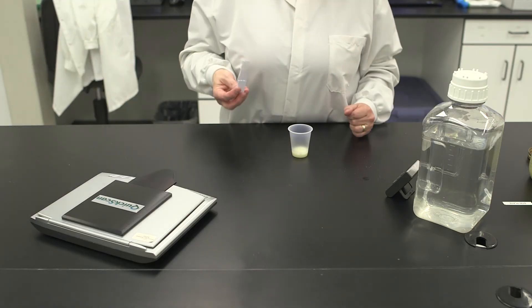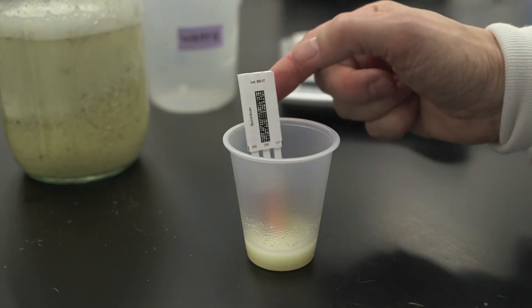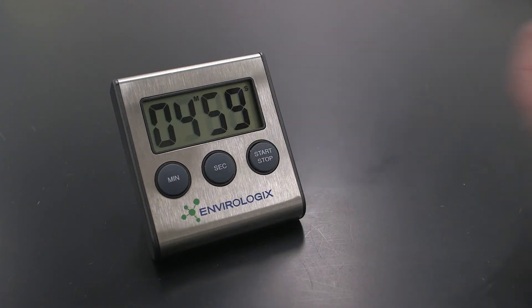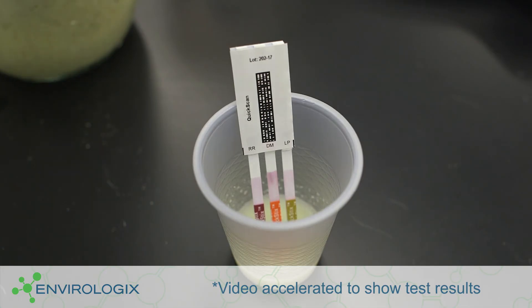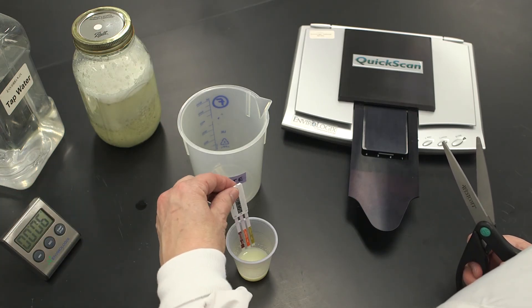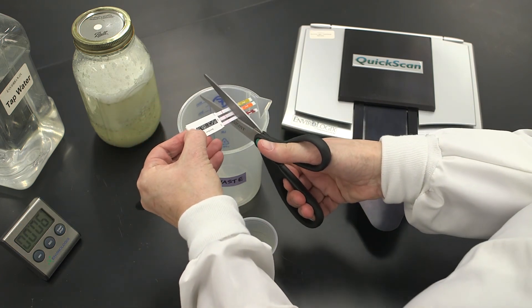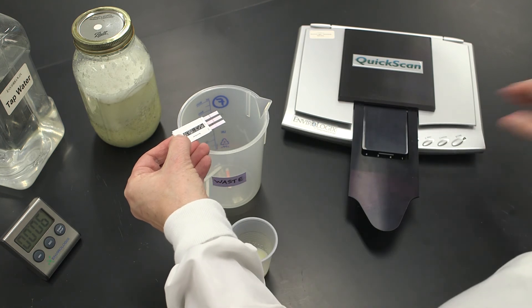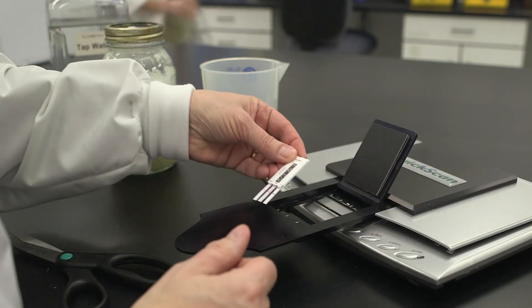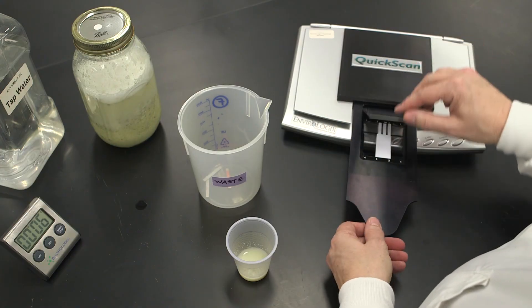Insert the quick comb into the cup with the arrows pointing down. Allow five minutes for the reaction to occur. At exactly five minutes, remove the quick comb from the cup. Cut off the reaction strips just above the tail pads. Immediately place the comb into the quick scan reader for quantification.